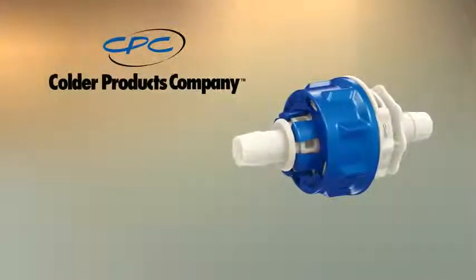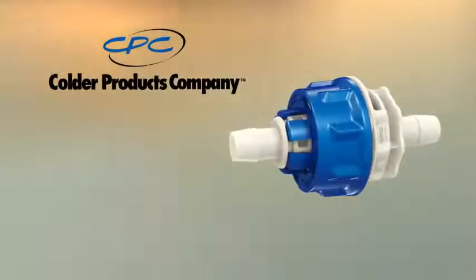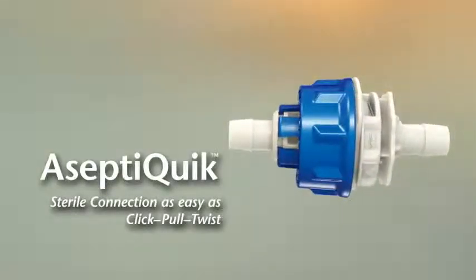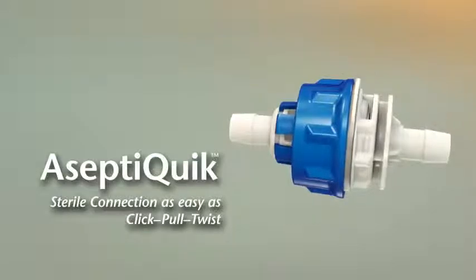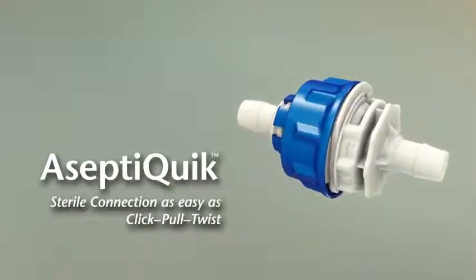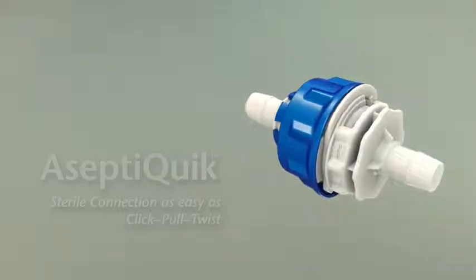Colder Products Company advances sterile fluid transfer with the introduction of the AseptiQuik sterile connector. The intuitive click-pull twist design provides the ease of use and reliability expected from the leader in single-use connection technology.